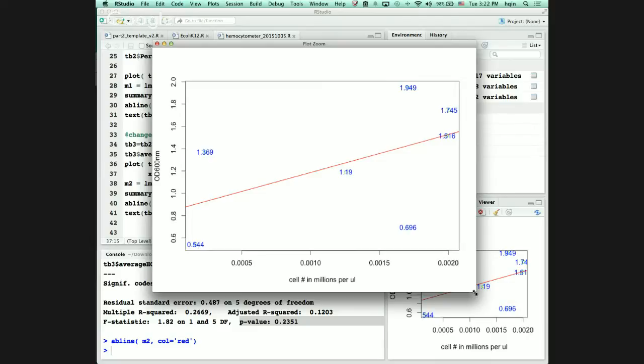Okay, very good. If you can see the data file, that means you have drawing practice. And that basically should be part of the lab report.